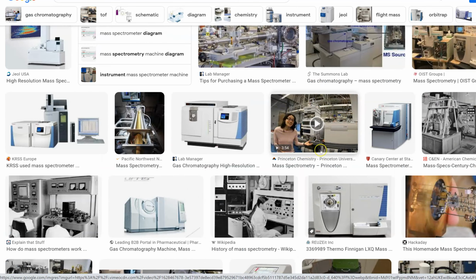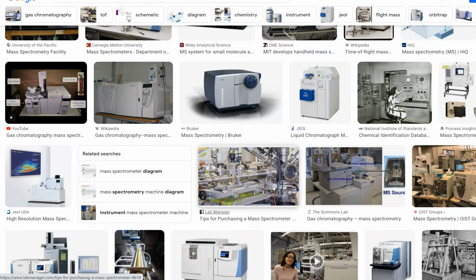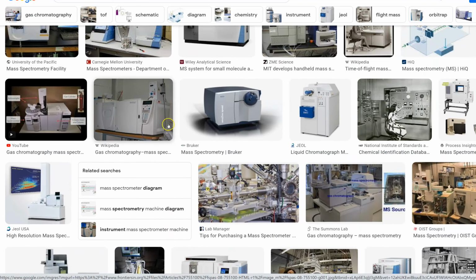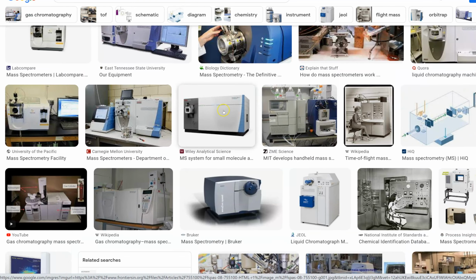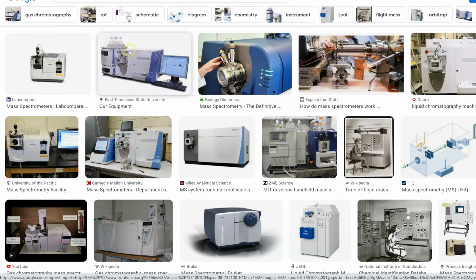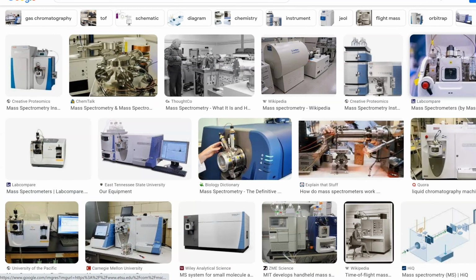This is a good video, this Princeton chemistry video about mass spectrometry. I'm actually going to show this in class, so you can look that up. It's on their website. It's actually trying to entice you to take chemistry from Princeton because they have such a great lab setup. And so you can see all of these devices and see the sizes of them. They're not small and they are not inexpensive. So if you look here, you can see the screen attached, which is giving the readout. And you kind of see the readout on that one. So anyway, that just gives you a general idea of what these things are.